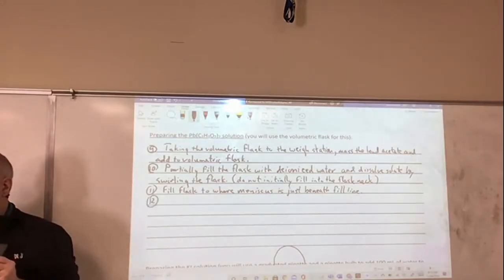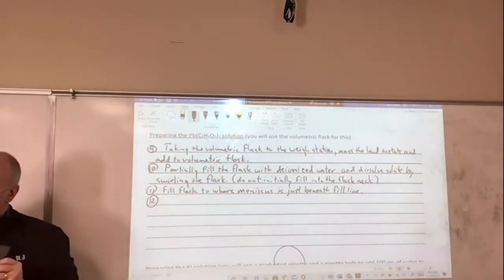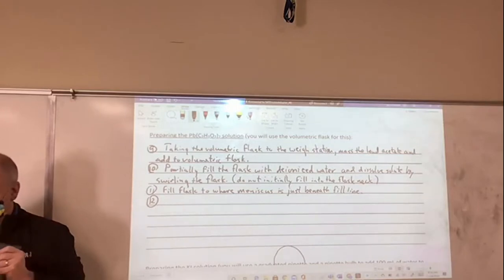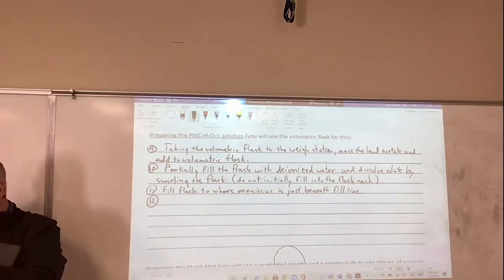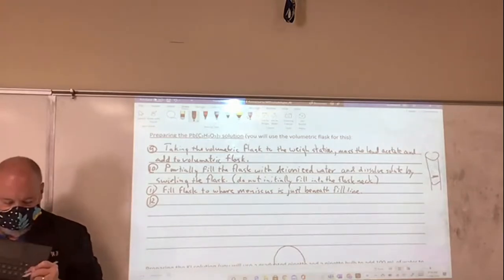Then what did we do? Lucy, what did we do next? So right now we've got, there's the fill line, and our meniscus is right there. How did we fill it the rest of the way? Excellent. Use the correct terms and everything.